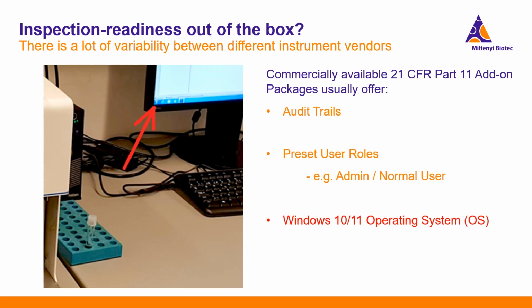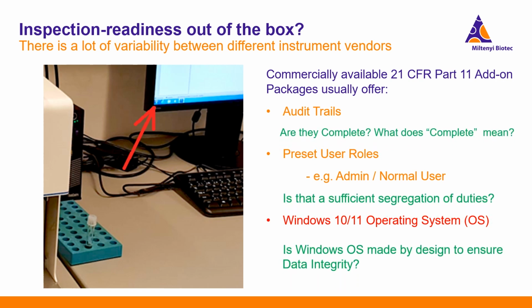However, from the validation point of view, one has to ask questions like, are there audit trails that I can see? Are they complete? What does complete mean? Are the available preset user roles sufficient for segregation of duties? And do they also mirror my needs? And of course, is Windows made by design to ensure data integrity?